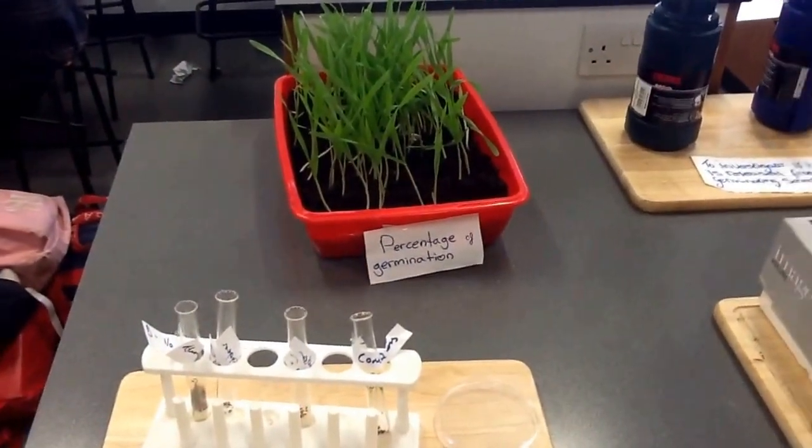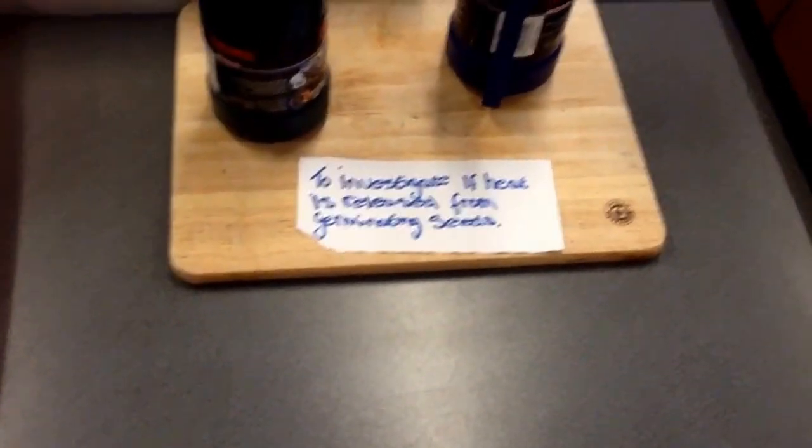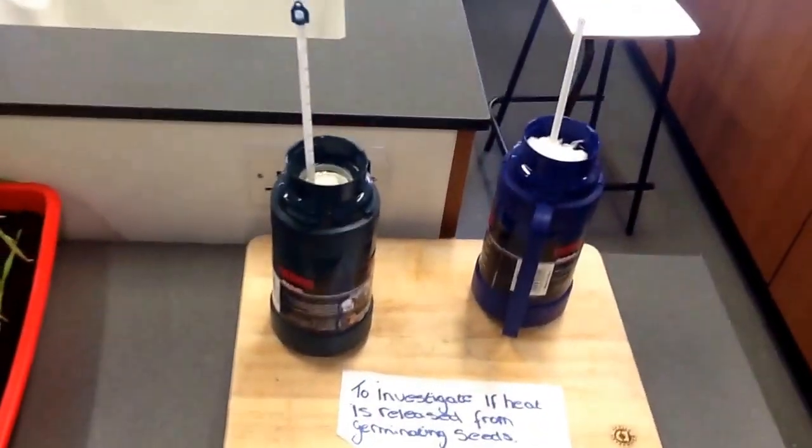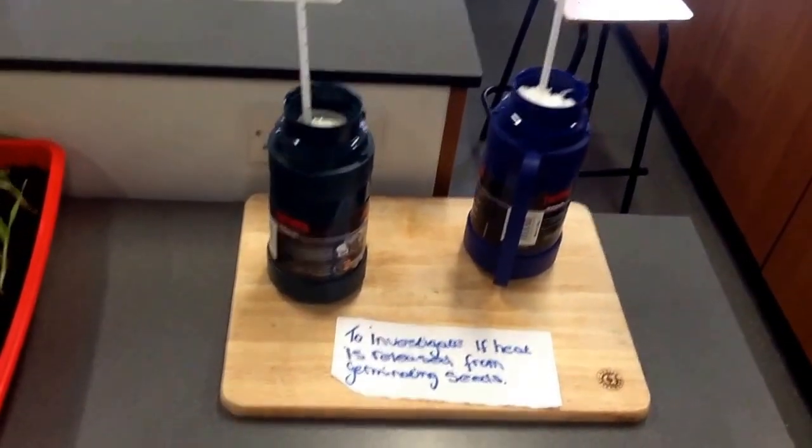This experiment shows that heat is released from germinating seeds. We got pea seeds in both flasks. We boiled one set of seeds, killing the seeds by denaturing them.